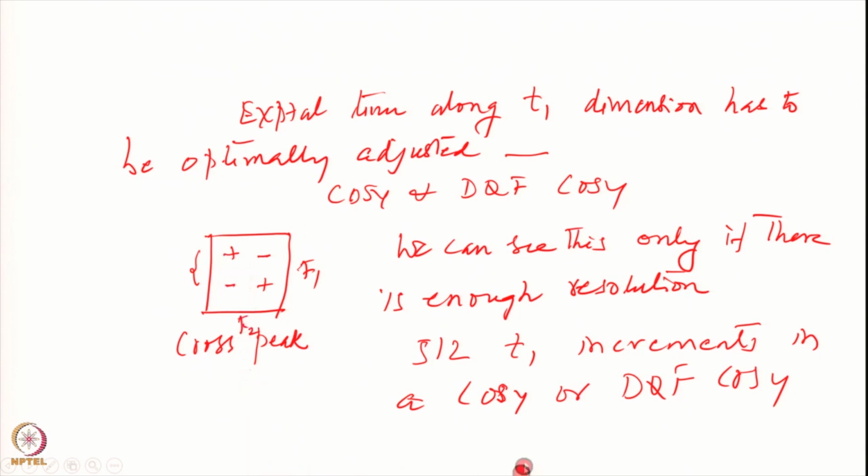Therefore this actually is quite an important limitation for those kinds of experiments where you have COSY and where you have antiphase characters. Antiphase characters meaning plus minus components along these cross peaks. Okay. So this is so far as the 2 spin systems are concerned.